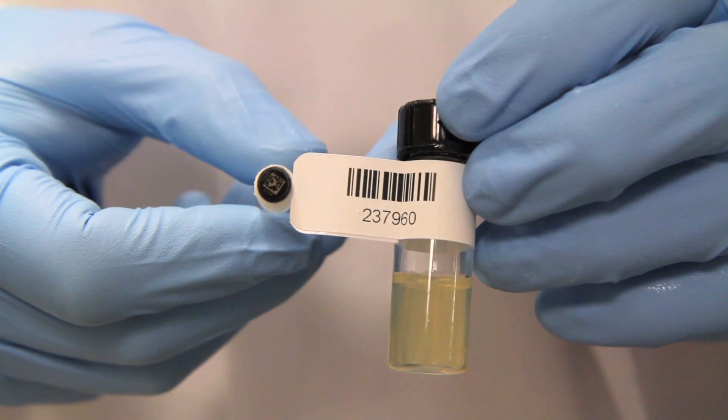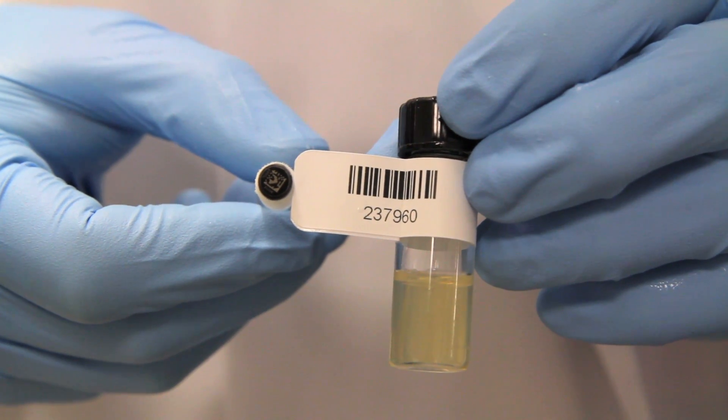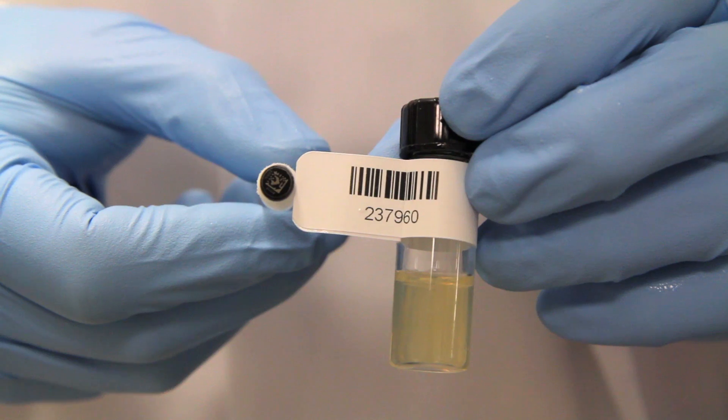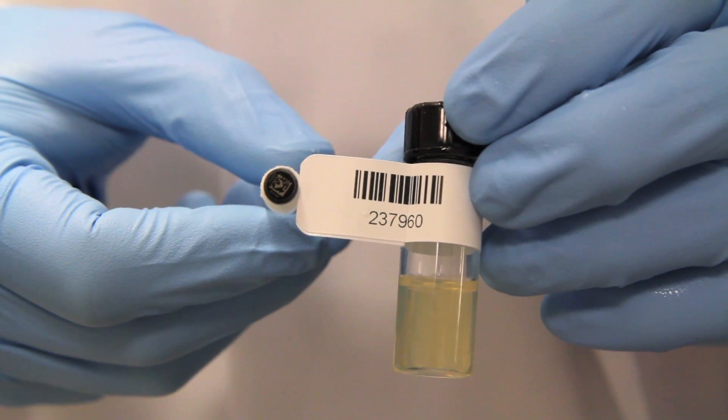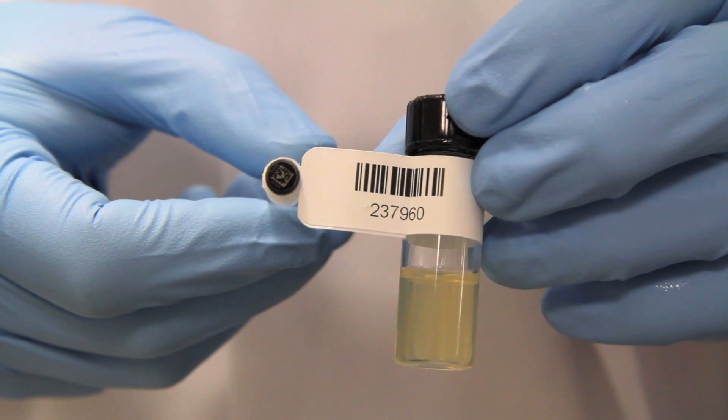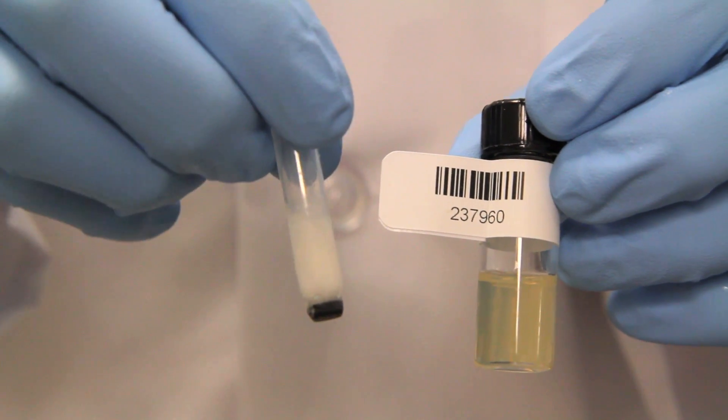Plasmids from Addgene are shipped as bacterial stabs. Addgene technicians match the 2D barcode on the bacterial glycerol stock tube with the barcode on each bacterial stab to ensure that the correct sample is shipped.